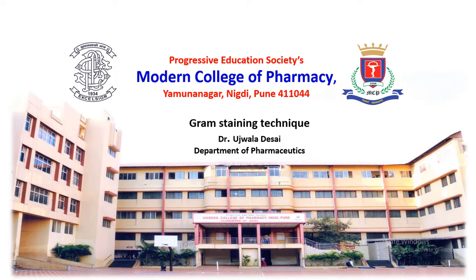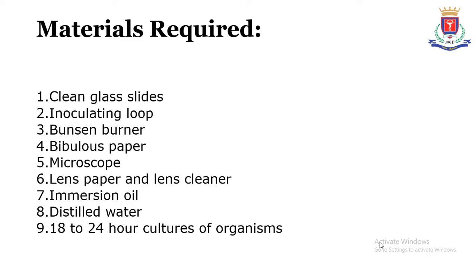Hello friends, I am Dr. U S Desai, working as an assistant professor at PS Modern College of Pharmacy, Nigdi, Pune. So today we will see the gram staining technique, which is one of the types of differential staining technique.